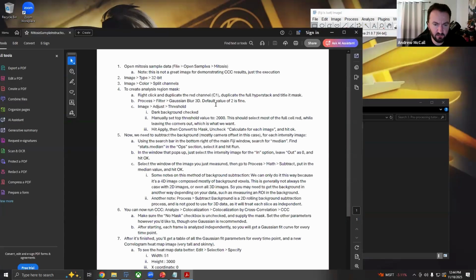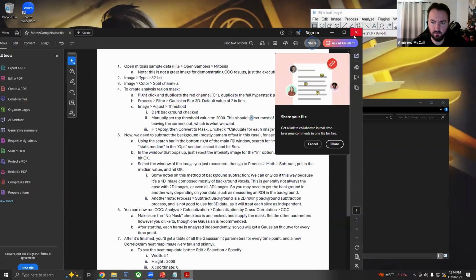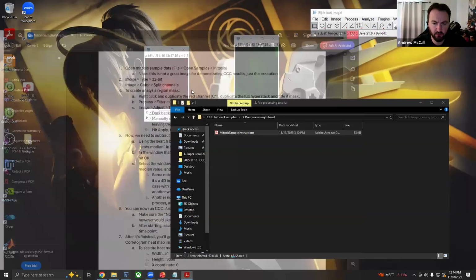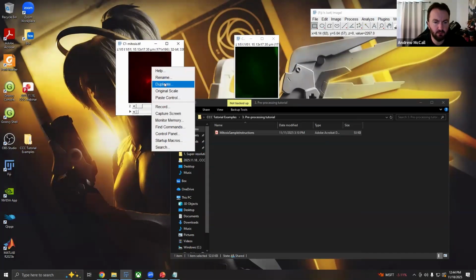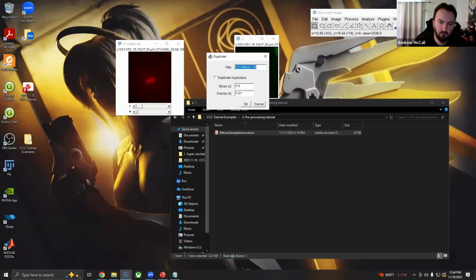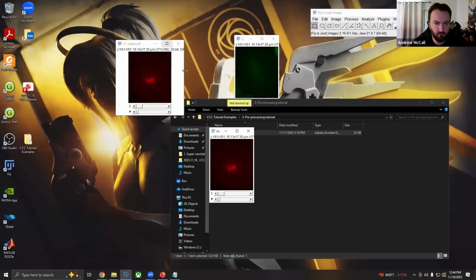Now my memory is failing me because I don't remember which channel we use to generate the mask. Oh God, what did I do? There we go. So yeah, channel 1 here, we're going to right click, duplicate, create a mask. There are other ways to do that if you want.